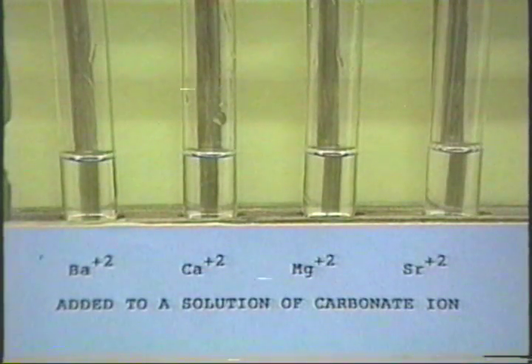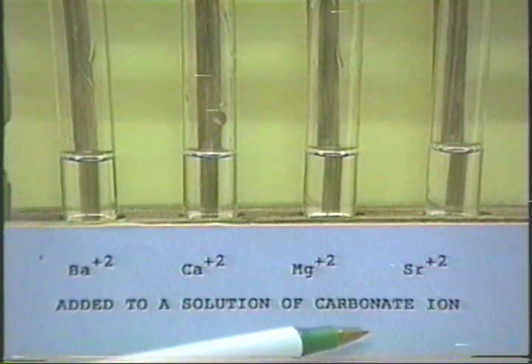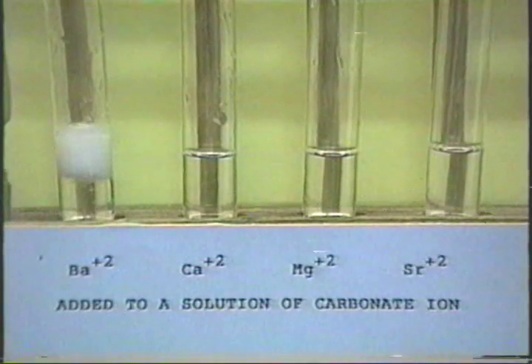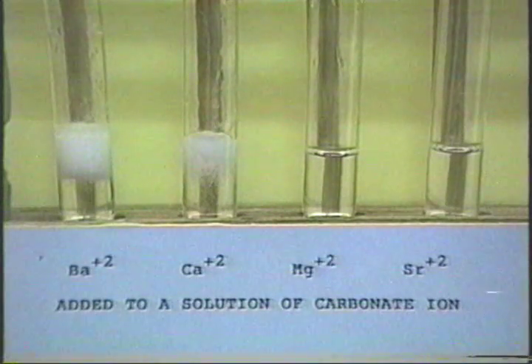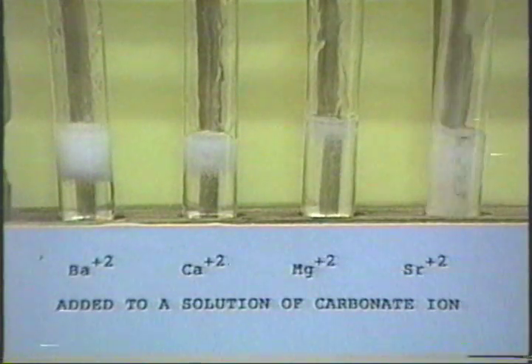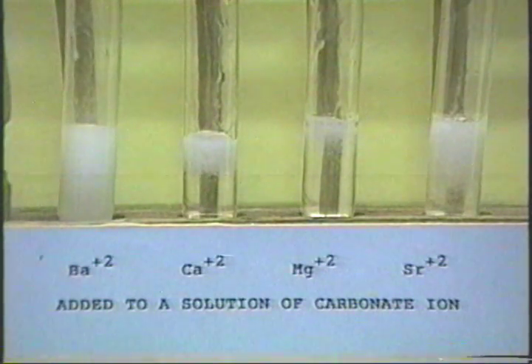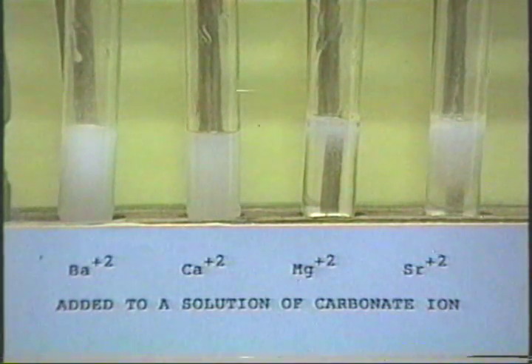This is a sample of what you'll be doing today. There are 4 tubes here, and each of them has the carbonate ion in them. To the first, we'll add barium ion. To the second, we'll add calcium ion. To the third, we'll add magnesium ion. And to the last, we'll add strontium ion. Now we're adding about equal amounts of each. Now what we'll do is we'll stir these up. Make sure you clean the stir rod between each of these tubes.